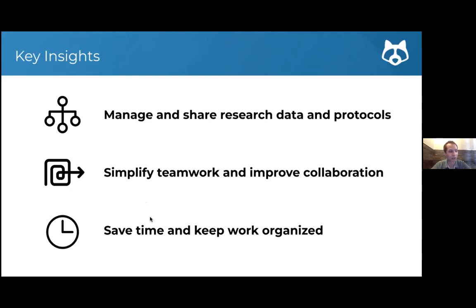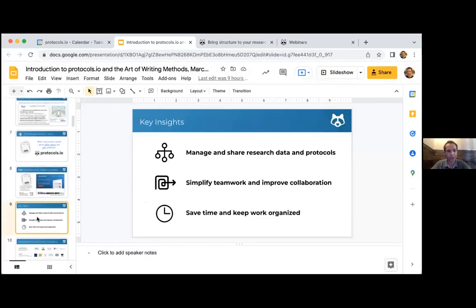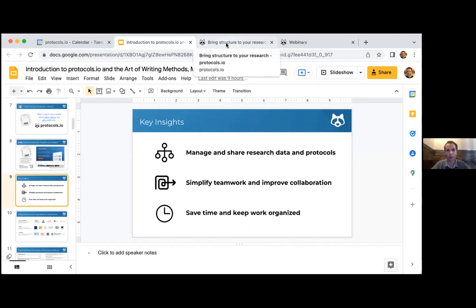And I think one of my favorite quotes about reproducibility is, your most likely collaborator is yourself in 6 months. And so if you get started on Protocols.io early on in your research project, it should save you time all throughout the research cycle and then make publishing easier. So at this point, I'm going to switch out of the slides and actually do 5 or 10 minutes of an introduction to Protocols.io live.